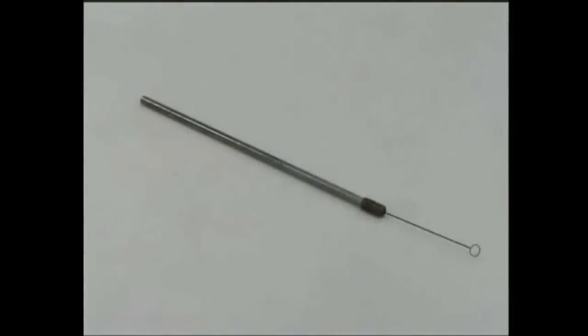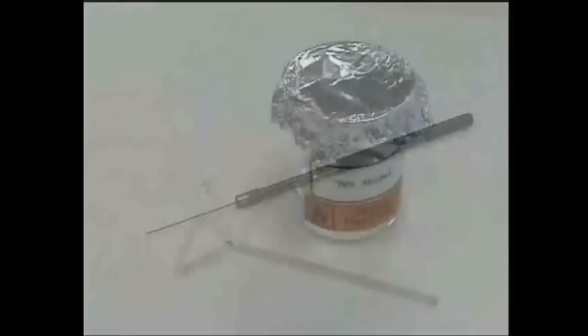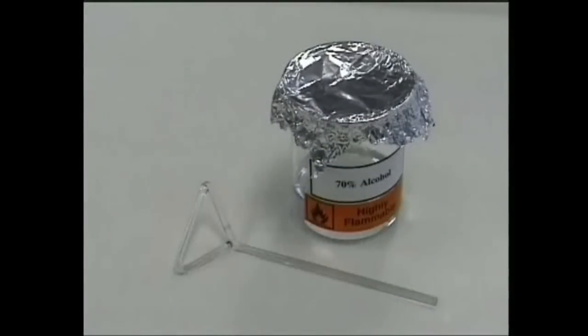You'll also need an inoculating loop and wire, a glass spreader, and a beaker of alcohol. This is used to sterilize the spreader and is kept well away from the Bunsen. You can cover the beaker with foil or a watch glass to minimize the risk of the alcohol catching fire.